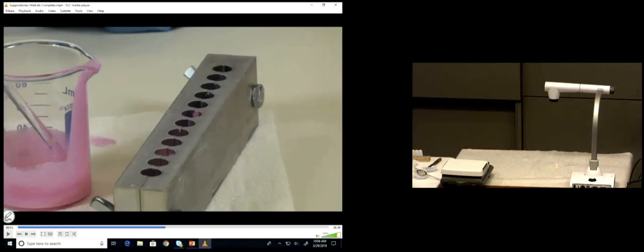And some of you, that drives you crazy. You try to rinse, and you try to rinse, and you try to rinse, but you rinse too much, and then you overfill the cavity. So no more than 3 total rinsings. And make sure the amount that you rinse with is a very small amount, because your rinsings also need to be divided between those 10 cavities, so that it's still below the top of the cavity, never even with your rinsing.